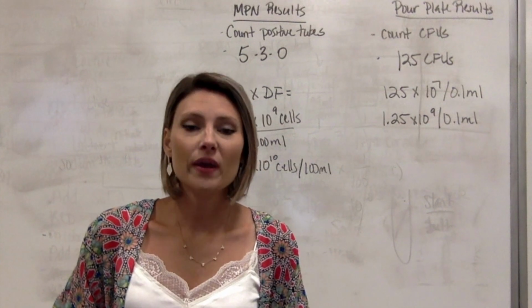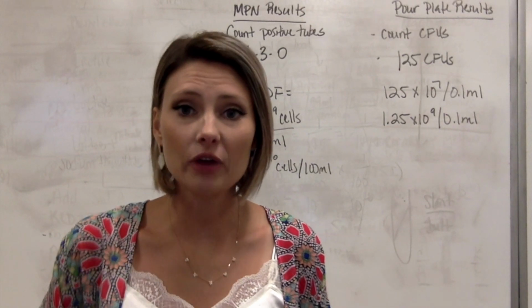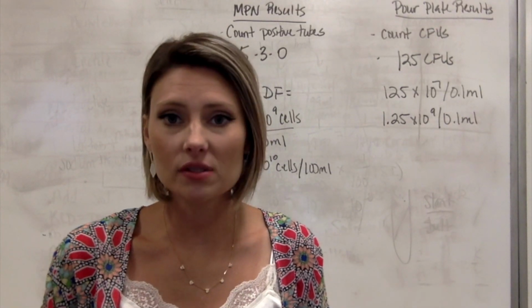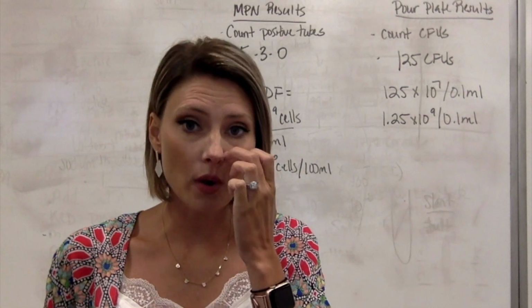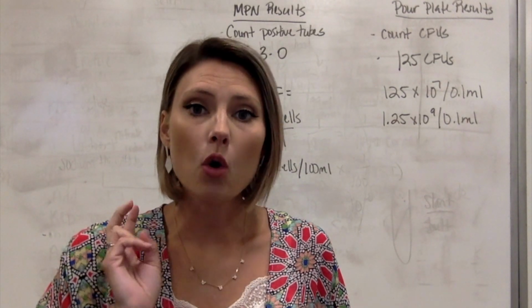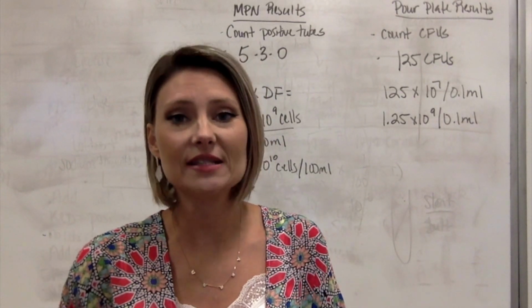Hey everybody, we are back in the lab today and we are going to be working on the exercise bacterial enumeration out of your lab manual. And if you remember, I've already posted a video about serial dilutions. So I went over what they are and how to make them. And then we are going to use those serial dilutions today on two enumeration techniques. We're going to go over the MPN and we're going to go over the pour plate technique.